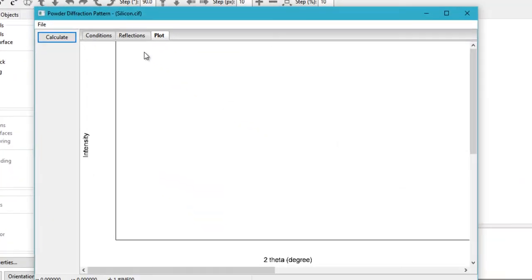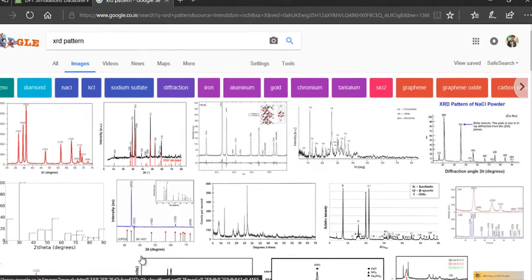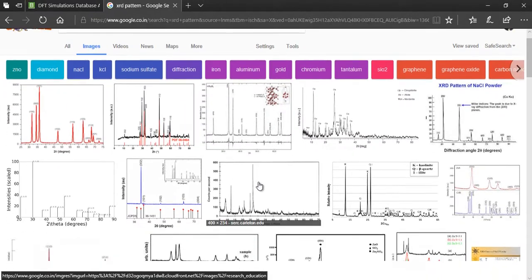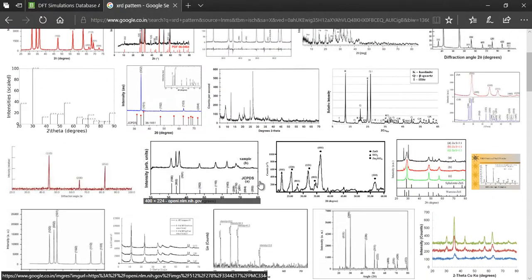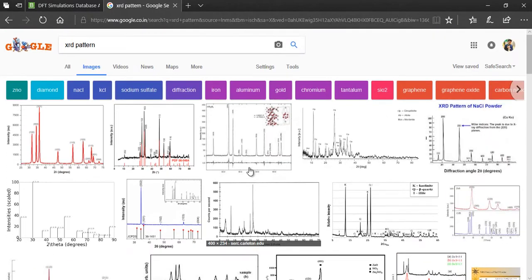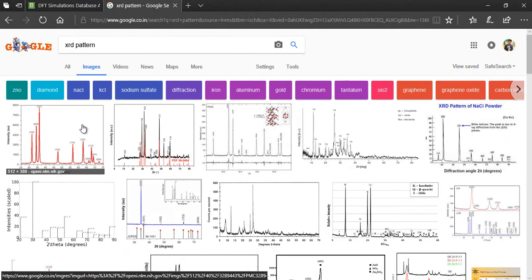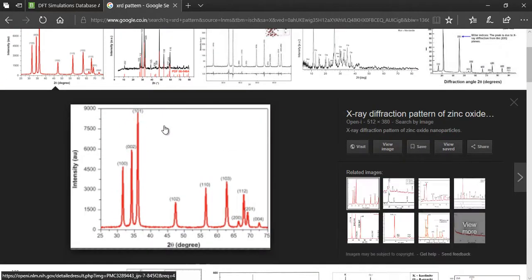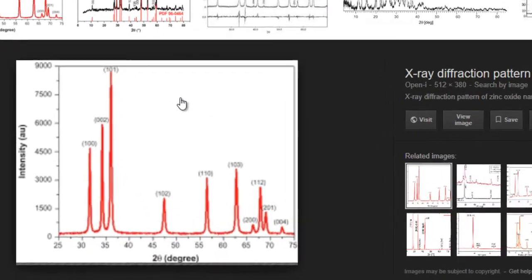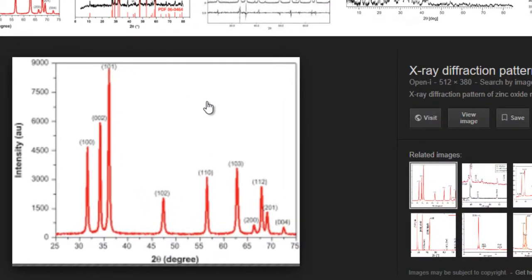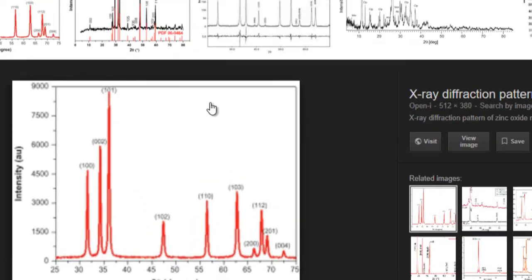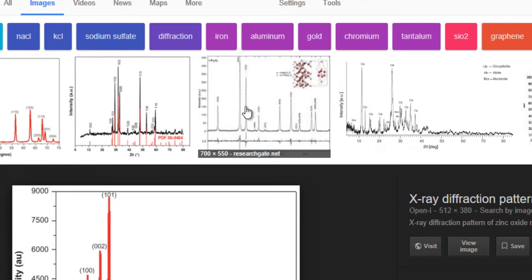Now before we do that, let me just show you what a typical XRD pattern looks like. You should already know it if you are watching this tutorial, but still. Here we have some examples of typical XRD patterns for various compounds.